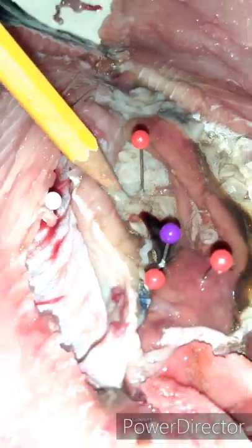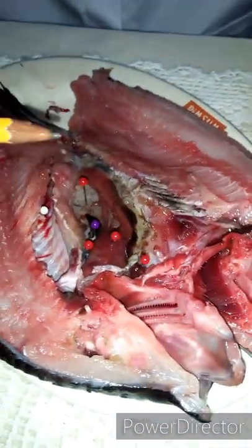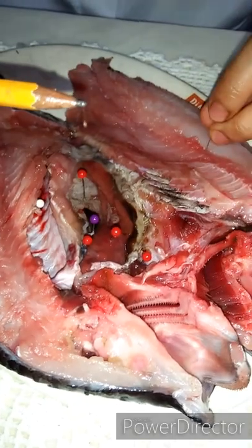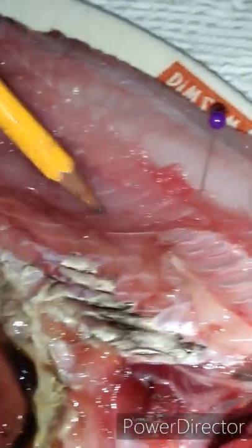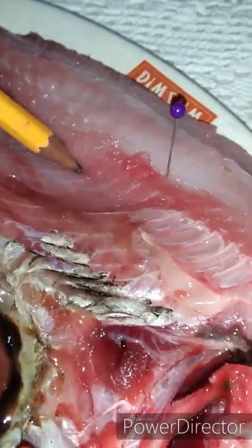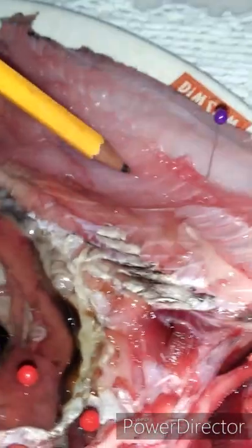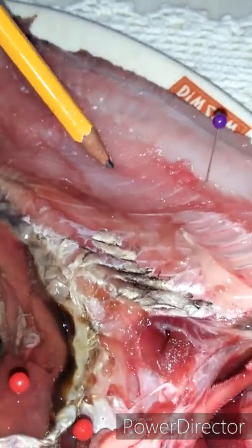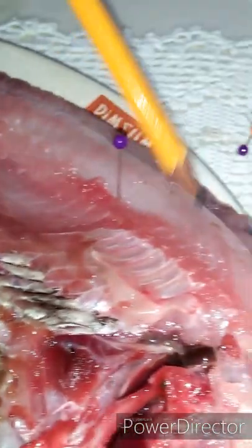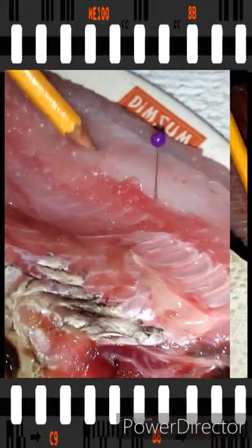Now we're going to locate the muscle — this one here is the muscle. The muscle provides movement and locomotion for the fish. It is also usually eaten and composes the fillet of the fish; this is the fleshy part.